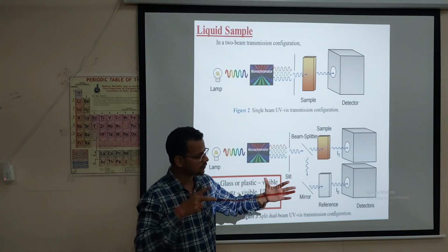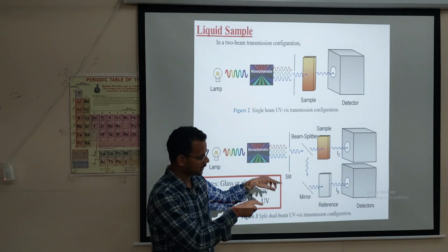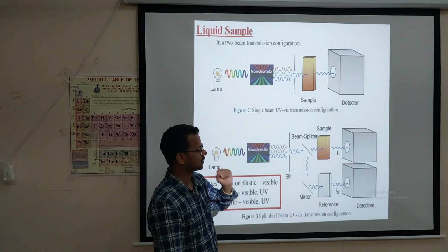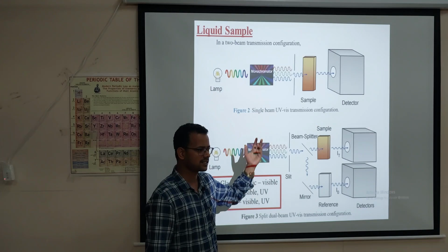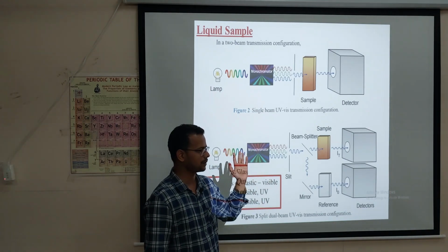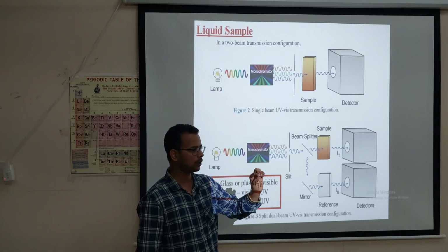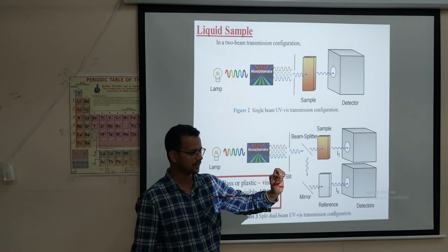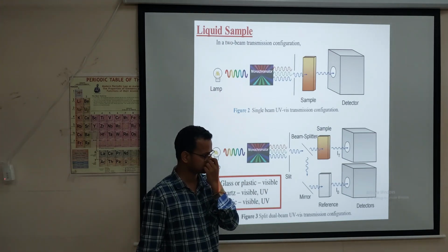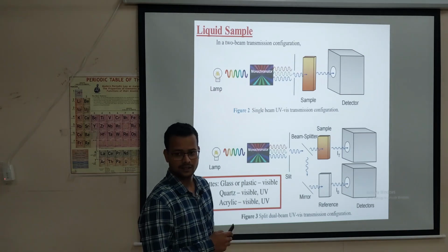But if you use a bunch of light there, we may not get the same result as we are getting here. In various physics experiments, like the double slit experiment, you use a monochromator and slit. Slits are used only to allow a very narrow source of light to strike the sample, clear? This is the importance of the monochromator and slit.